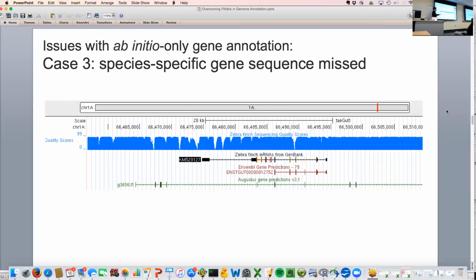And these could be, again, these UTRs, these could be really critical for taking a gene and regulating it in a different way. So getting these vocal learning type genes into instead thinking about these mechanical wing noises that they make. And yeah, so these are really critical. And again, without manual curation, a lot of these things are just going to be lost.